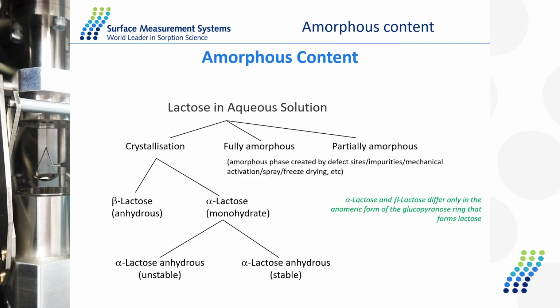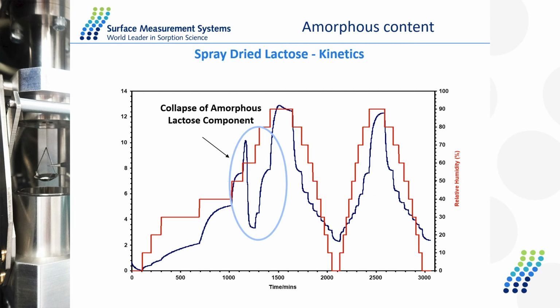Different types of material behave in different ways and have different crystal structures related to the crystalline form and the amorphous form. I'm not going to focus specifically on any type of material, but I'm going to give you the methodology that can be used to study the amorphous content in a DVS. And it all starts from the analysis of a standard DVS plot for a material that is amorphous and moves to crystalline. This is the plot that I'm referring to.